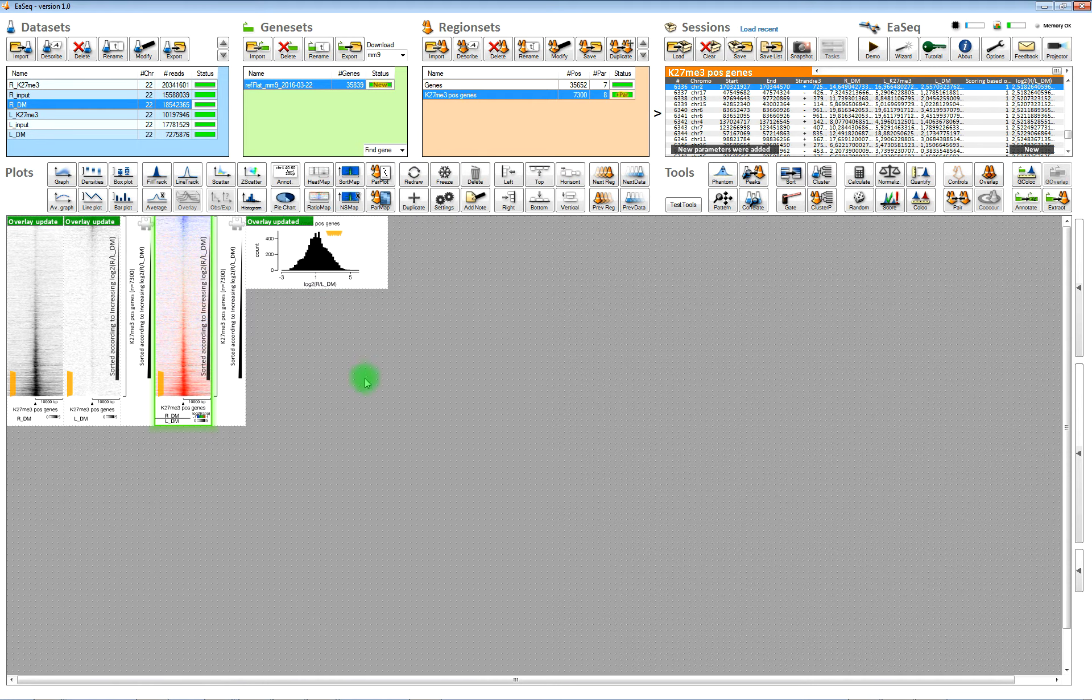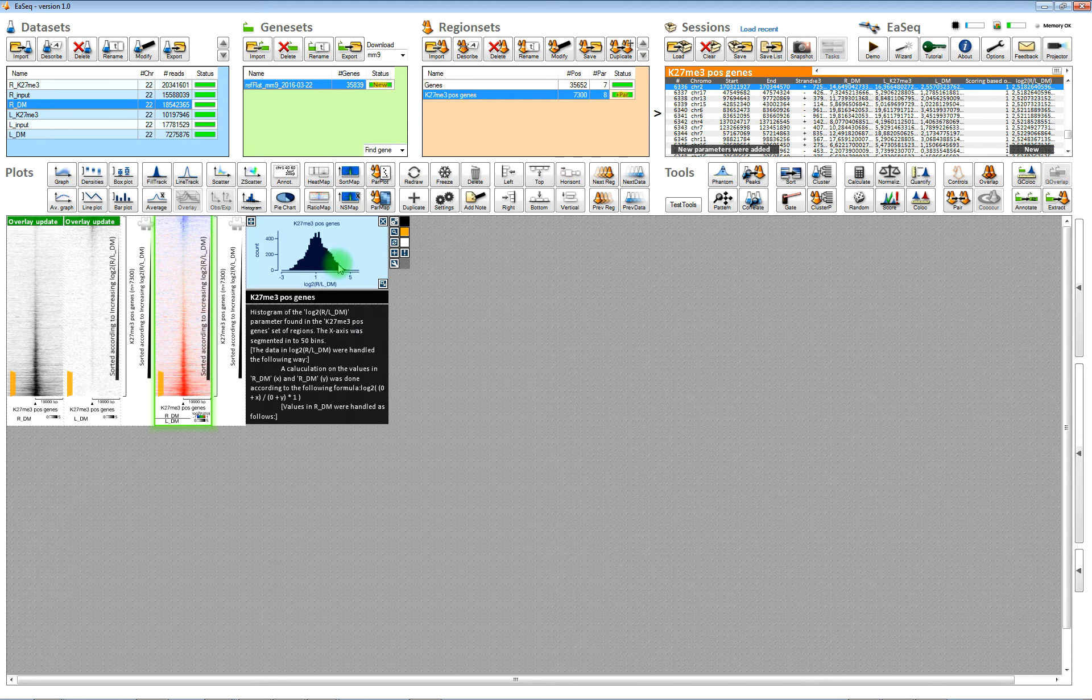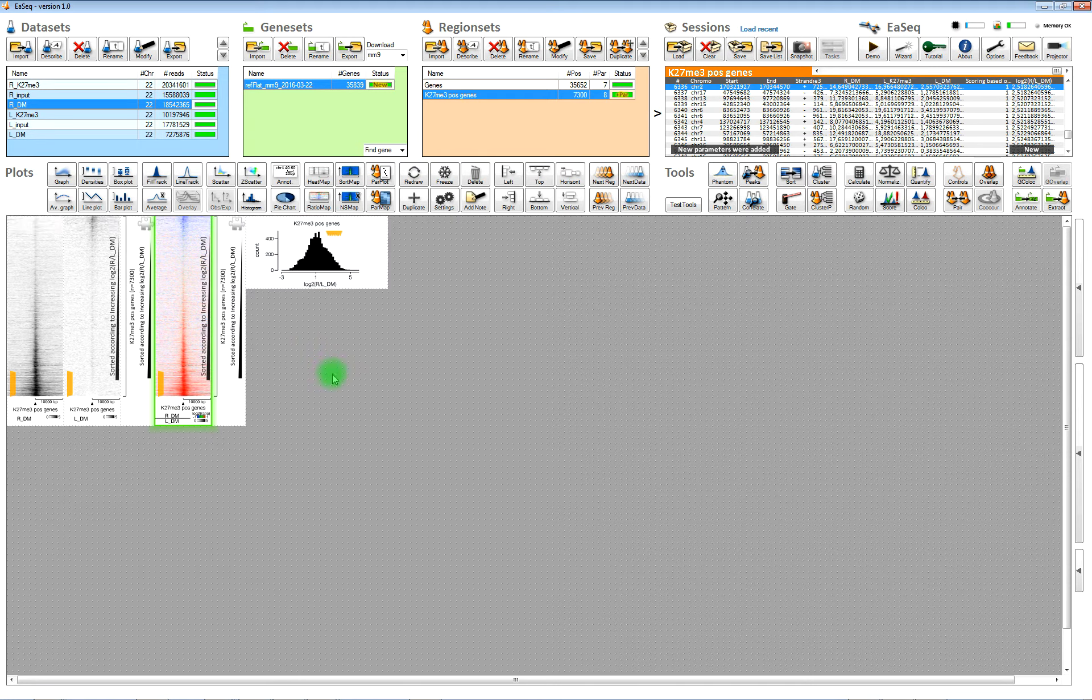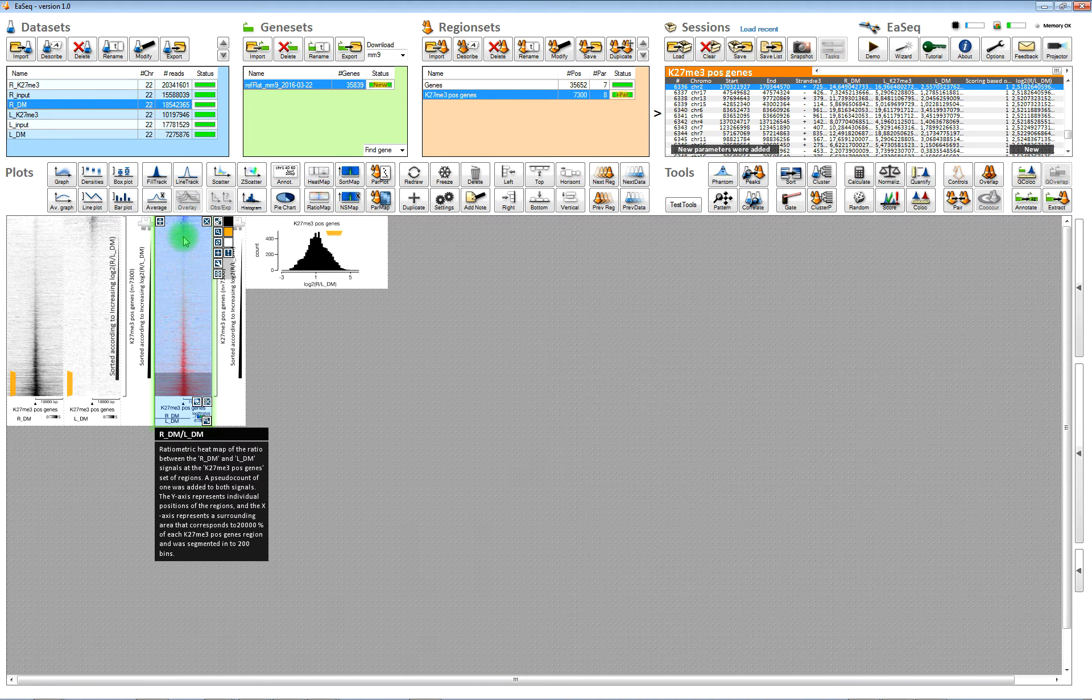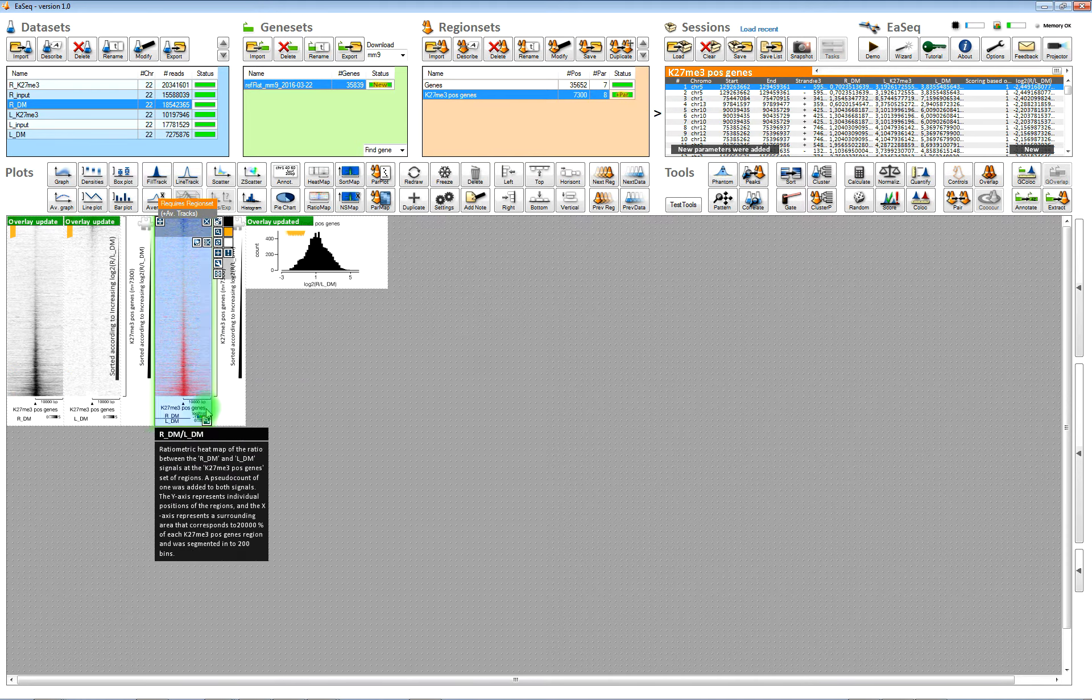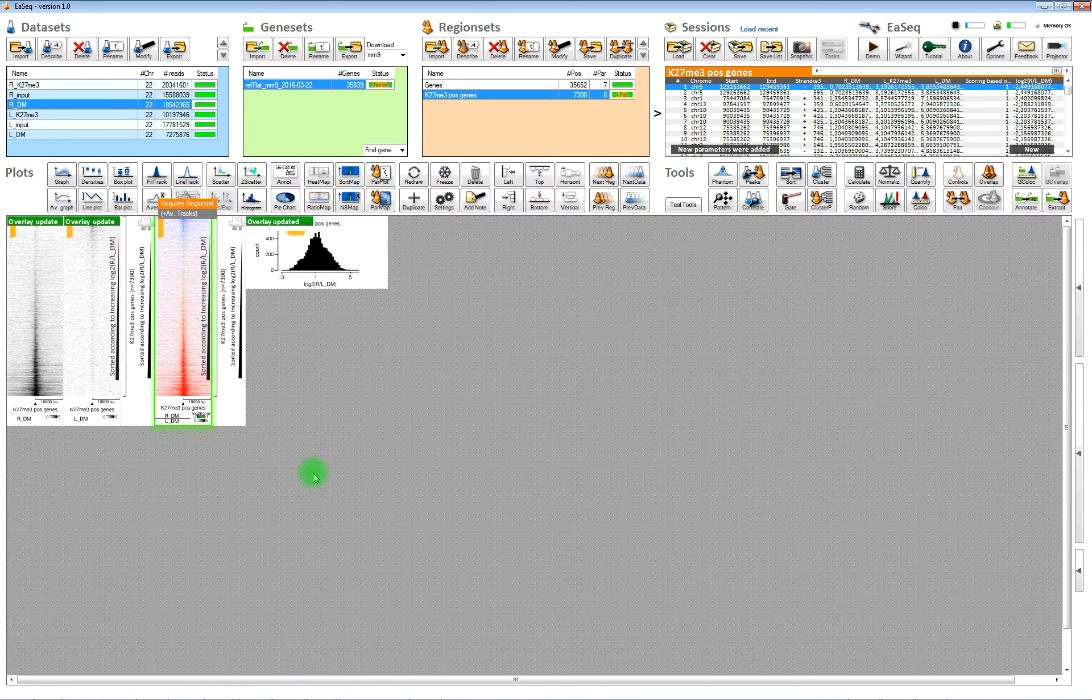And if you select some of the regions in the heat maps, then you will see them highlighted in the histograms. So the plots are connected to each other.